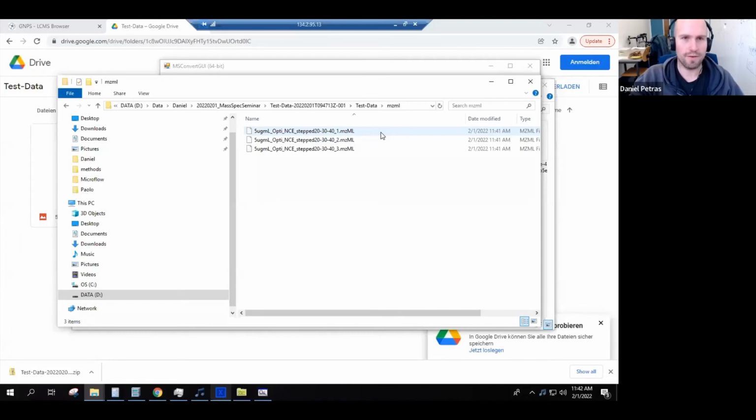So I think this is a very nice way of analyzing that data and making it publicly available. Okay, Tam has a question. Yeah, a short one. Is there a reason why you use mzML files instead of mzXML? mzML is simply the newer version, and for compatibility reasons, I would stick to the latest versions and choose mzML. GNPS also works with mzXML, so if you still have mzXML lying around, that's okay. But if you now convert new files, I would pick mzML as a format.